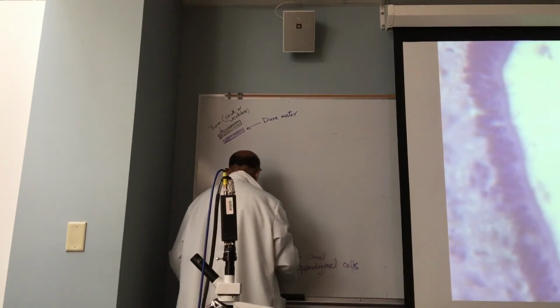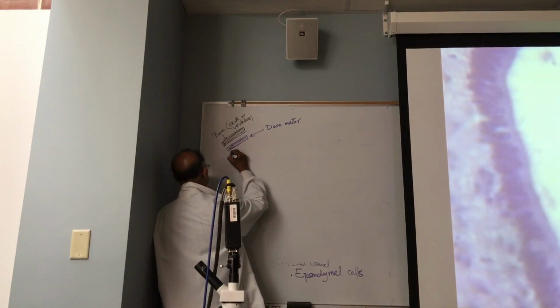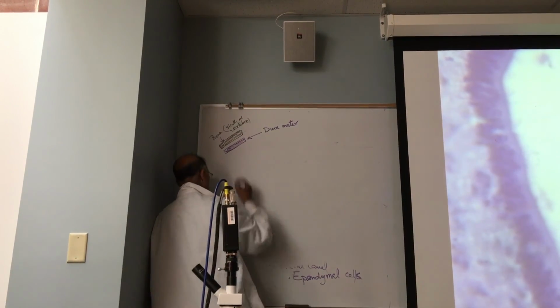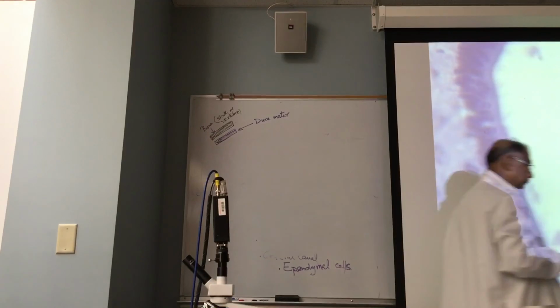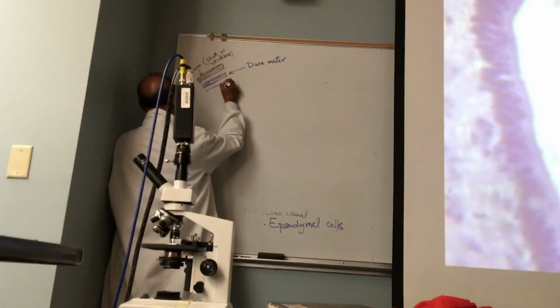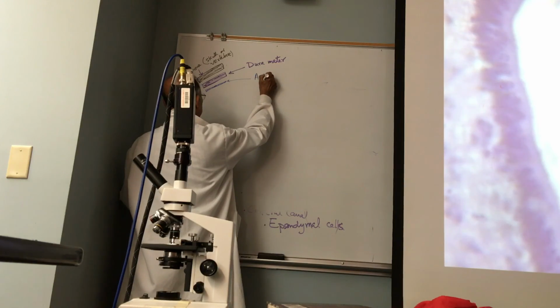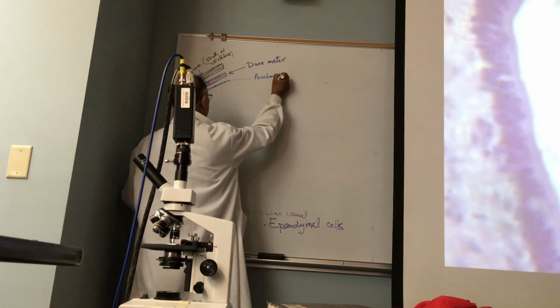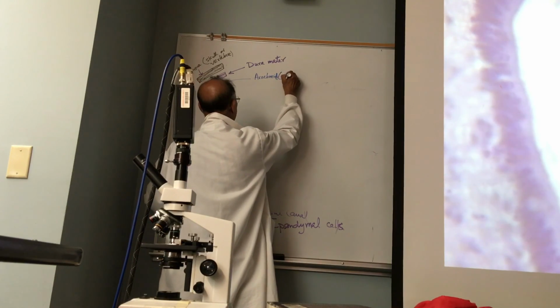Then there is a space, and there is a space here. There. This is like spider web, and that's why this is called arachnoid. Also maybe called arachnoid mater.